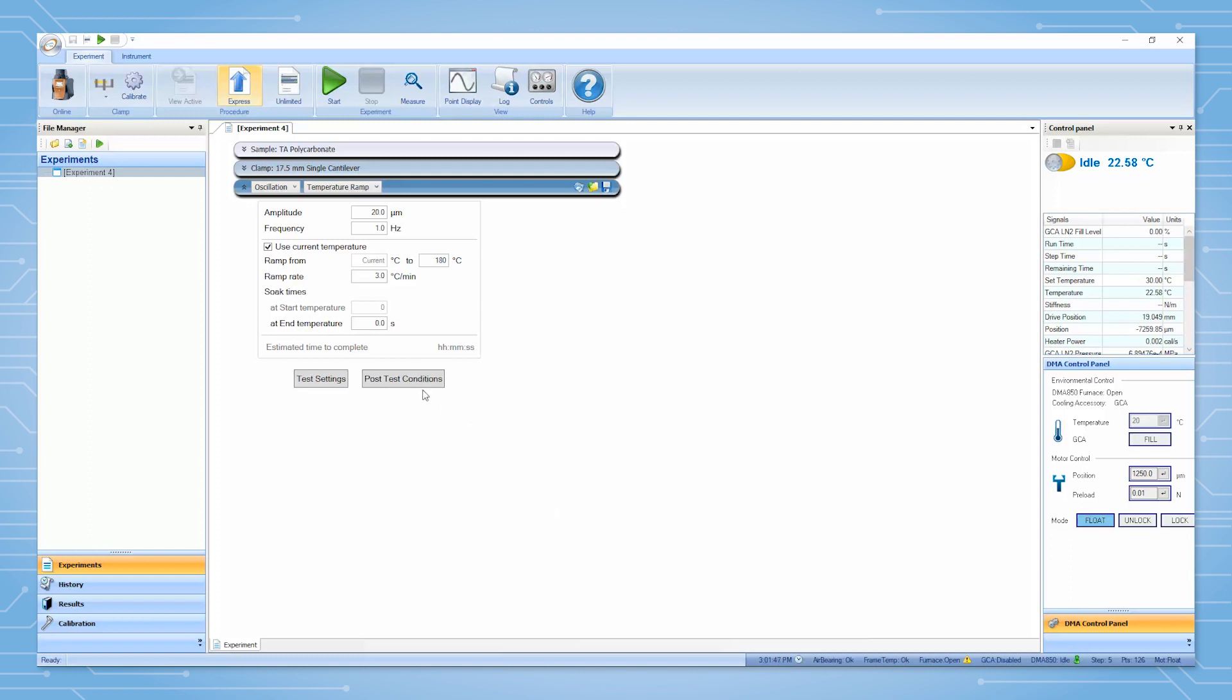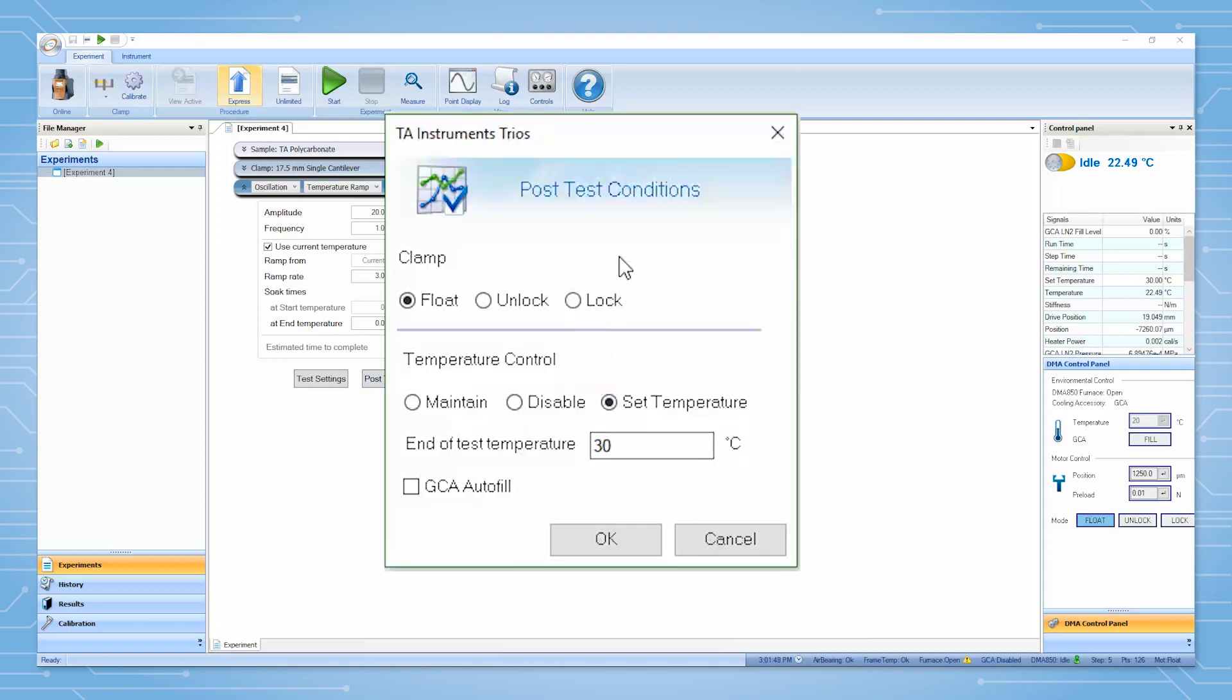The post-test conditions allow the user to set the clamp mode after the test to be float, unlock, or lock position.